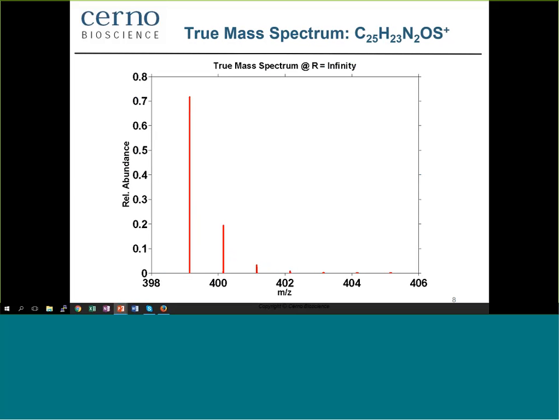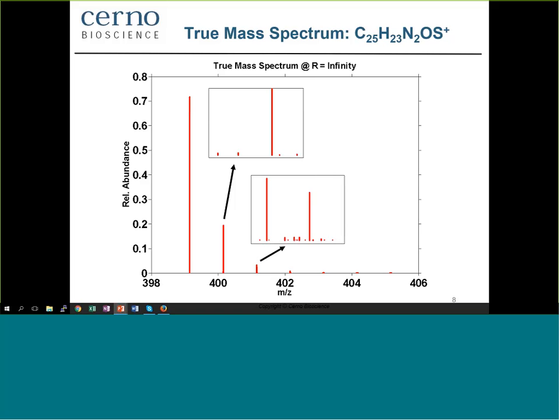The centroid data at first look does look like a theoretically calculated mass spec with intensities at the given mass locations. If you look more carefully, however, the true mass spec contains much more than just this centroided data. For example, under the A+1 cluster, one actually sees multiple isobars, indicating the presence of carbon-13, nitrogen-15, sulfur-33, and so on. It provides key elemental composition information that would normally have been lost with the crude centroiding done in a lot of mass spectrometers. The A+2 cluster, though weaker, contains even more detailed information regarding elemental composition, for example, the presence or absence of sulfur in the ion.